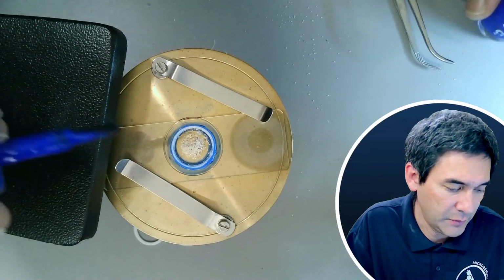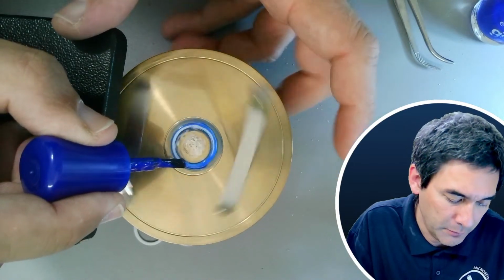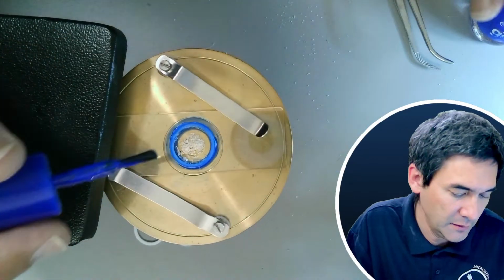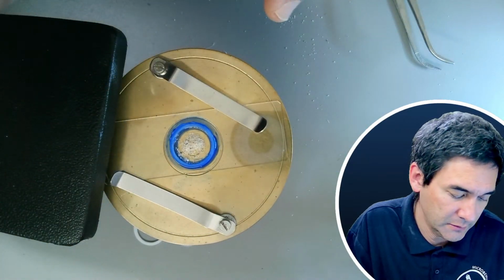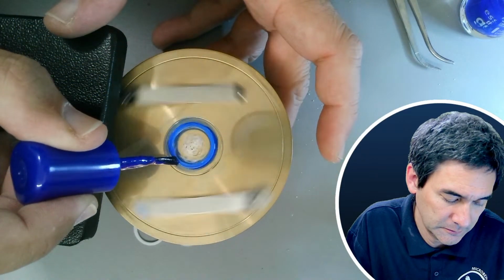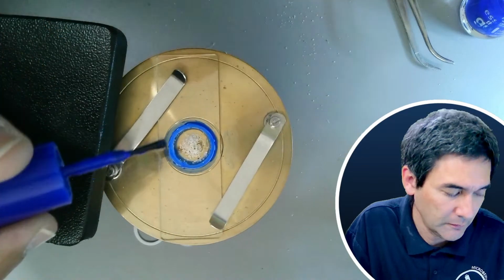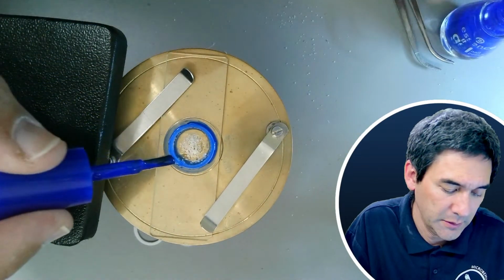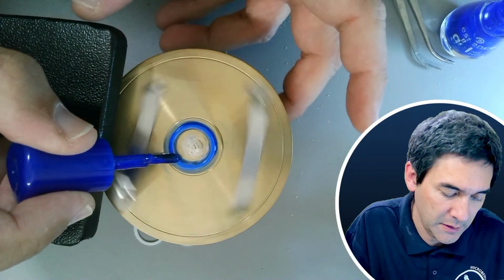Otherwise, I'd have to add a little bit more acetone or nail polish remover. This one is better. Okay, and another layer. And another layer.